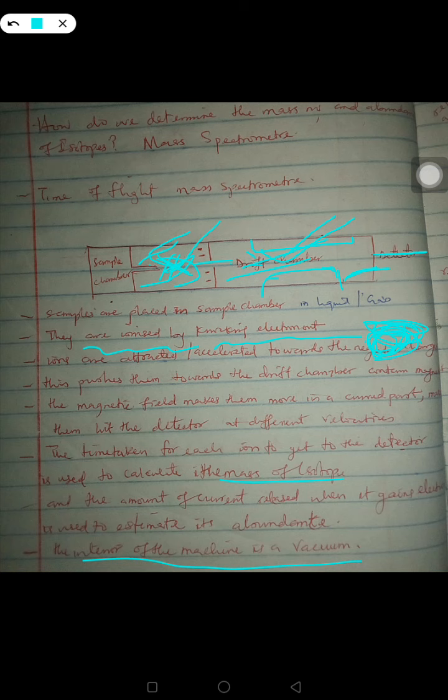So now, why do we have to mention that the interior of the machine is a vacuum? The reason is that the particles moving inside are extremely sensitive particles. For example, an ion formed from the sample chamber. If there is air there, air might contain nitrogen, for example, and probably the ion that is coming is calcium.